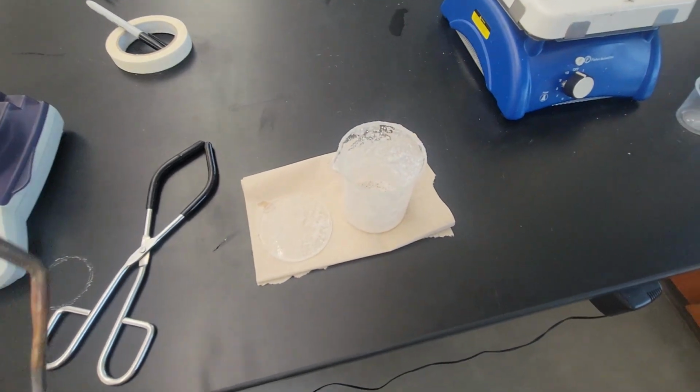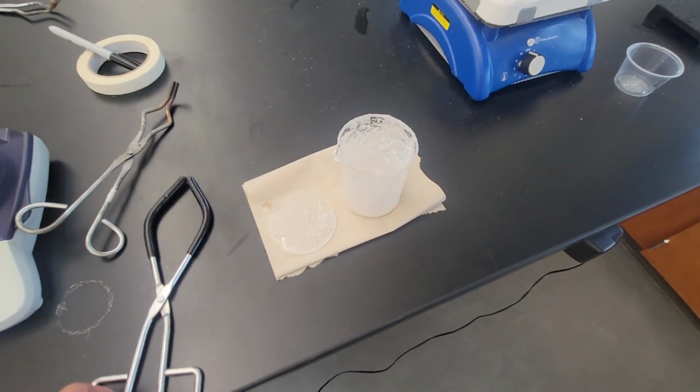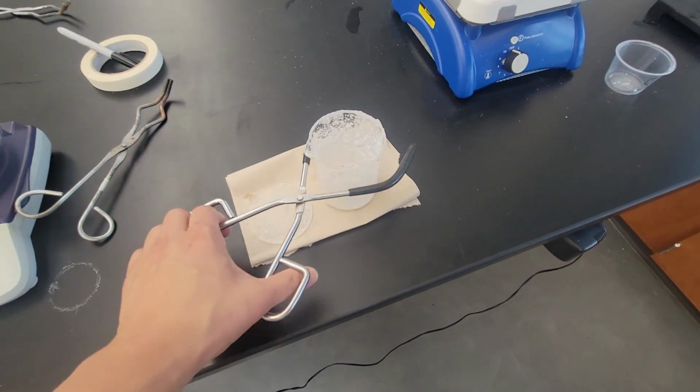And I'm actually gonna move both of these to the dryer so I get all the water out.